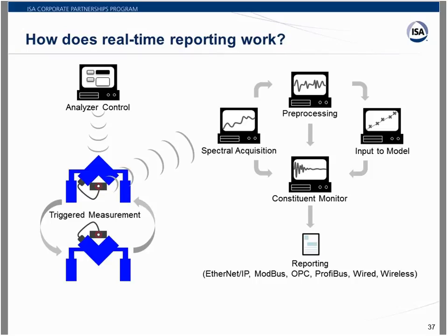And the mounted portable spectrometer can be controlled using an external computer or a laptop, which is pictorially represented as the analyzer control in the top left-hand side of slide 37. When using this analyzer control, the spectral information on the sample within the blender can be acquired and pre-processed before the moisture content is predicted using the model built initially from the known standards prior to the production process. The predicted results are immediately reported, thereby allowing the operator or the spectroscopist to control the process in real time in case the expected results turn out to be negative.